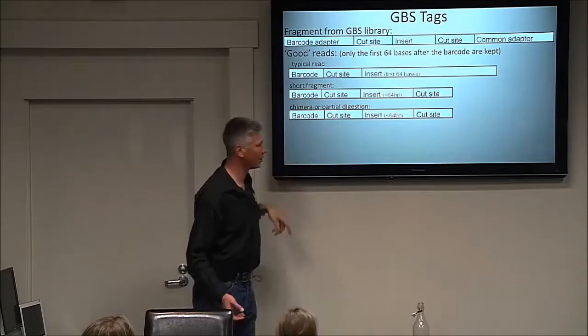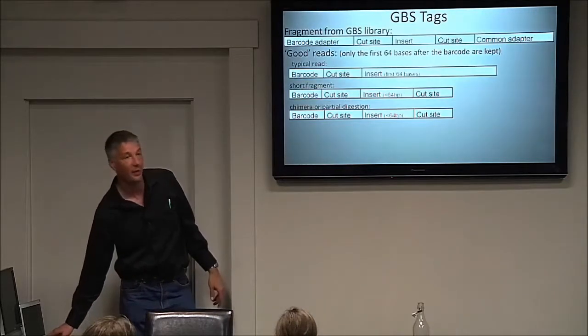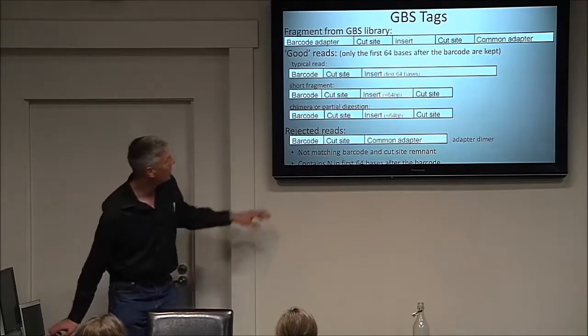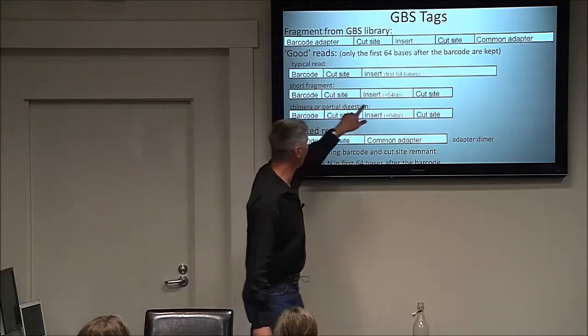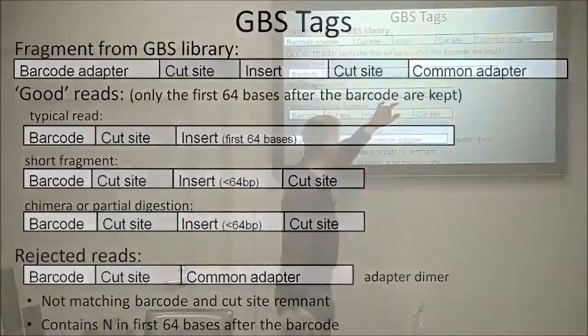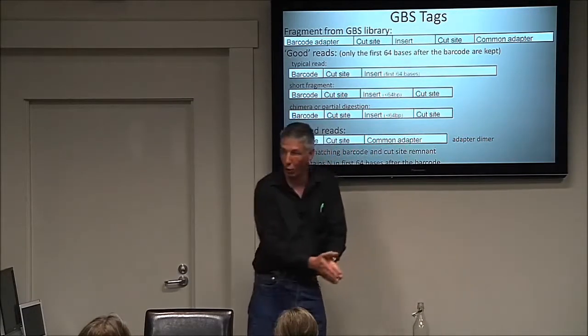Hit the forward arrow. Oh, I think you have to go back one. Maybe. Oh, maybe not. I think I messed up these slides at about 4 this morning. I'm very sorry. Okay. What we should see here is a cut site and then the common adapter. Okay, that would mean it was a short one.